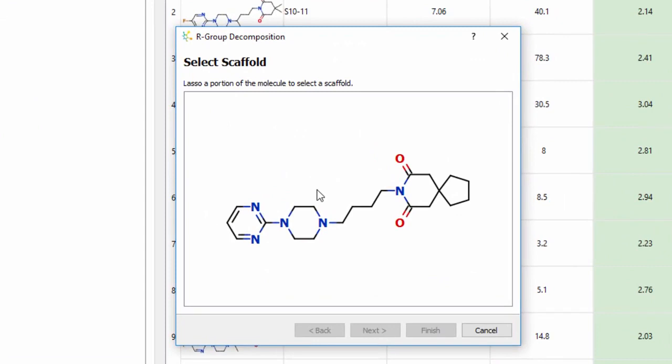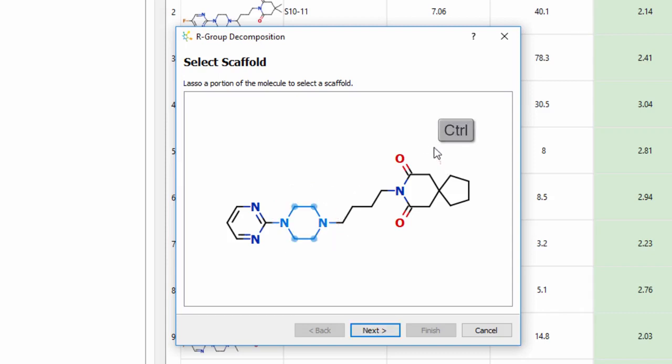This displays the selected compound and you can draw around the region corresponding to the common scaffold within the series. You can select multiple separate regions of the compound by holding down the Control or Shift key.